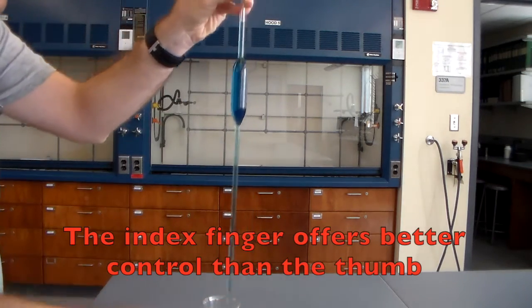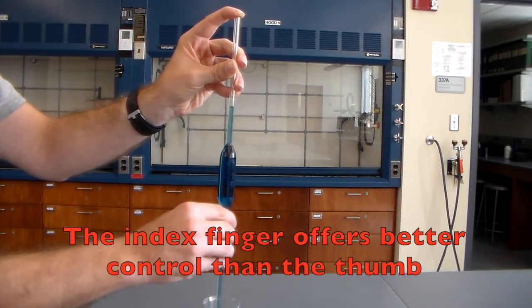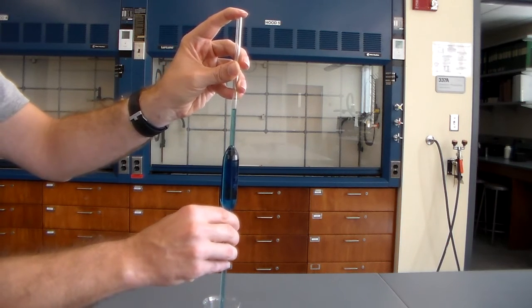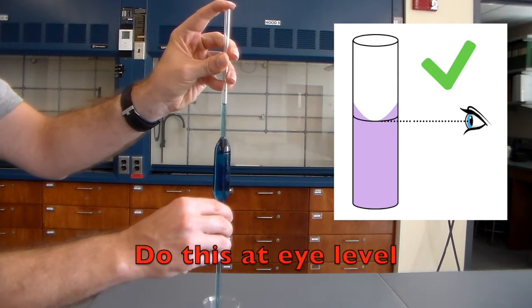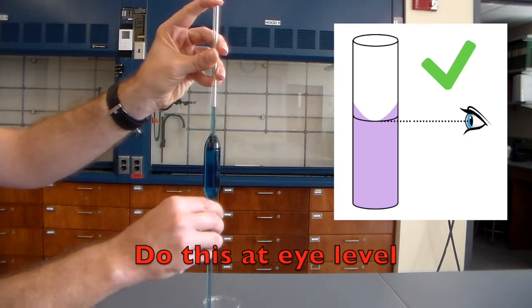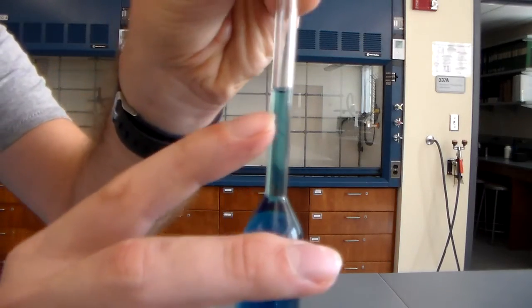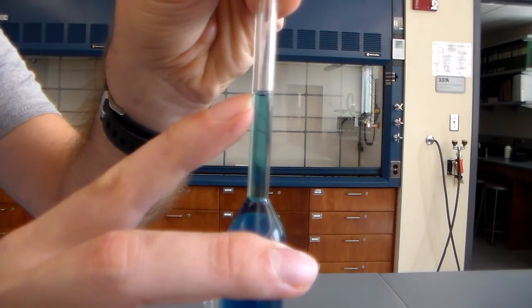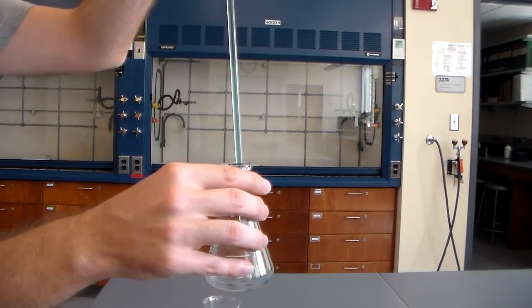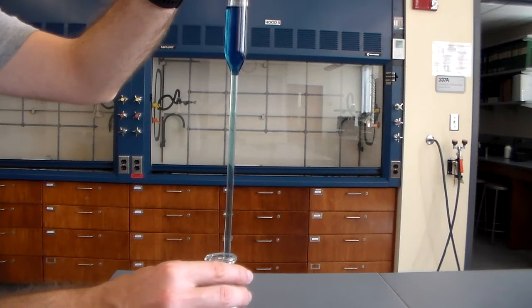So you simply just hold this over your waste container, and from your finger up here, just slightly release it, not all the way, but you just want it loose enough so then some air can get in and your liquid starts draining down. And you just let it drip down until you're able to see where it matches up. So the meniscus is matching up with the line right now. And as you can see, right there, the line and the meniscus are all lined up. So now we simply just hold it over our vessel and just let it drain. And this may take about a minute for it to fully drain here.